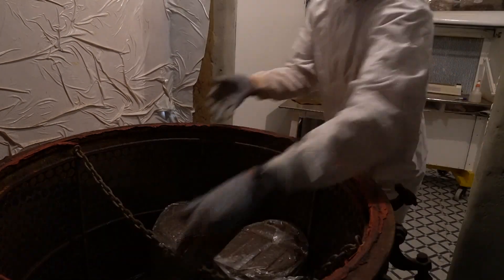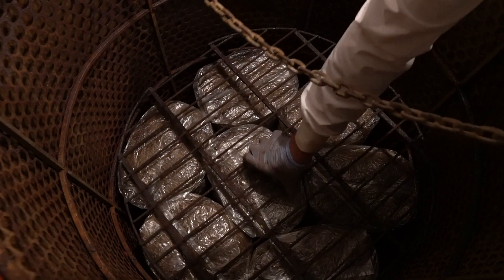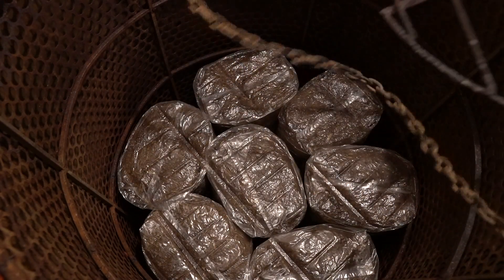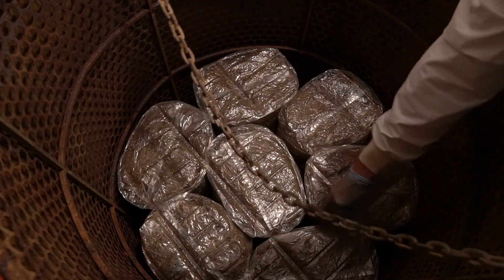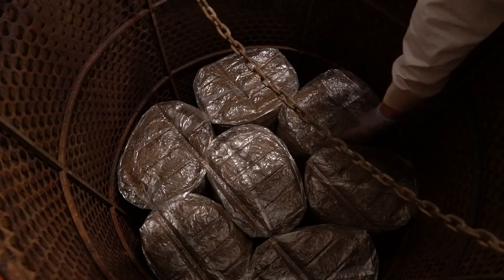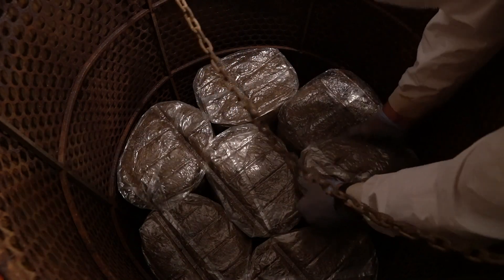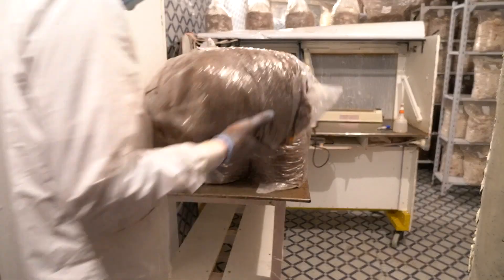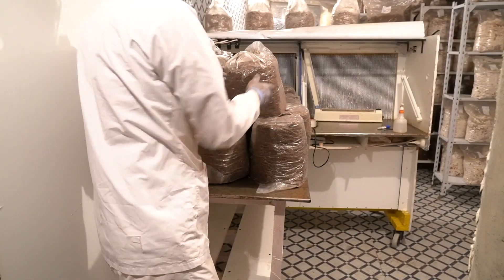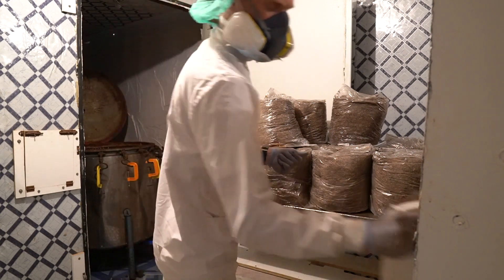I'm bringing blocks out onto my laminar flow hood — nice clean airflow. I have these false floors so with the big jumbo bags I can fit seven blocks on each floor: 24 blocks total with large bags, 21 total with jumbo bags. It's very important to have space around the blocks — that's a maxed-out cooker right there. I've got everything loaded up and all my blocks out in front of the cooker.